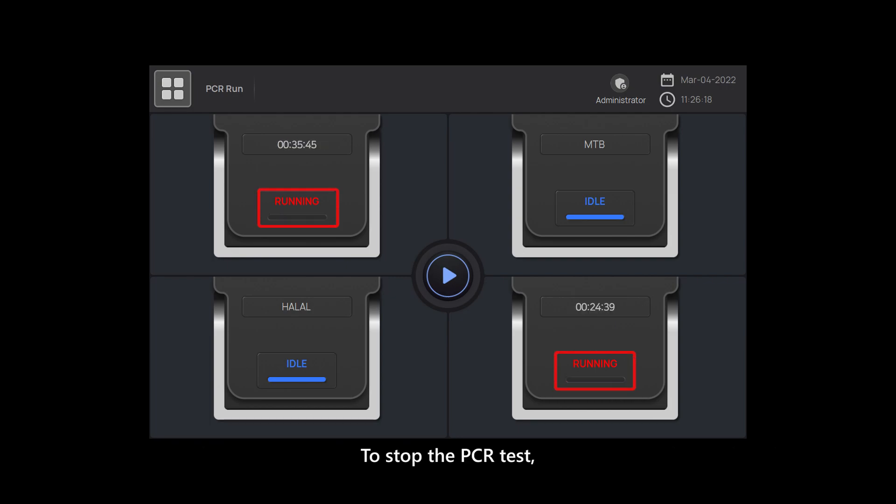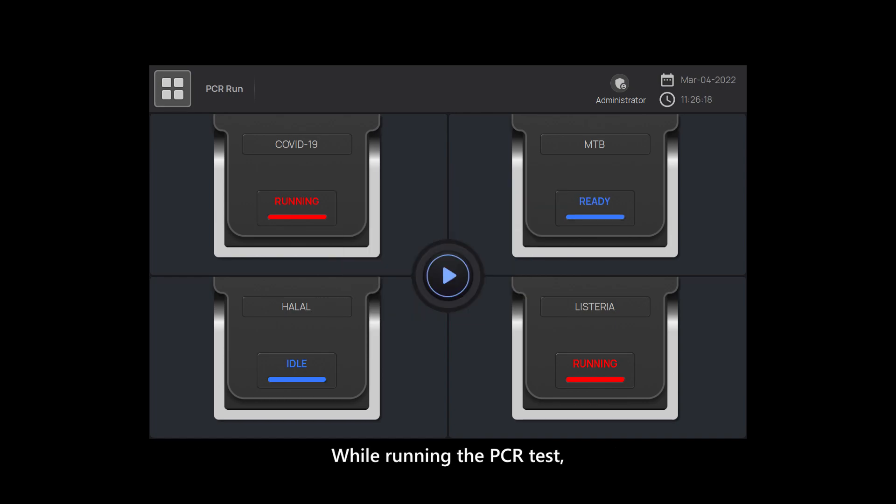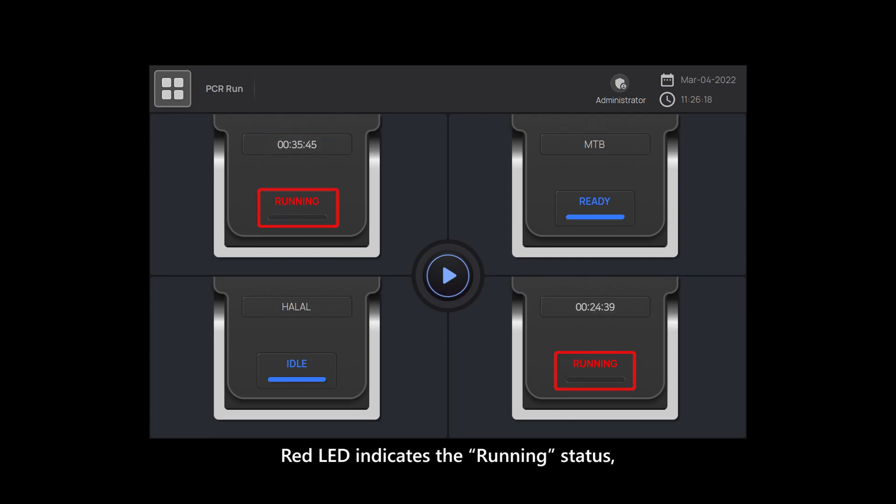To stop the PCR test, touch the red blinking part of the module and touch the OK button when the PCR stop pop-up window appears. While running the PCR test, the module displays information of the protocol name, the remaining time, and cycles. Red LED indicates the running status. Blue LED indicates the idle and ready status.